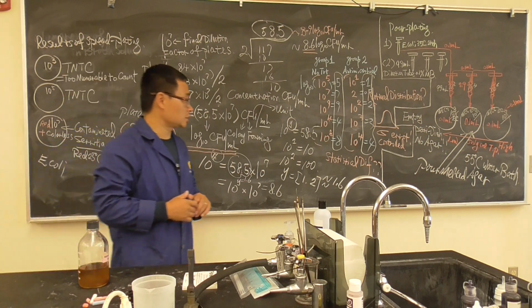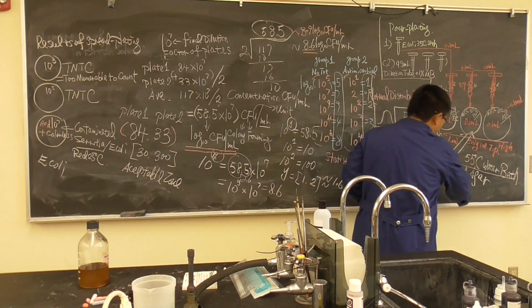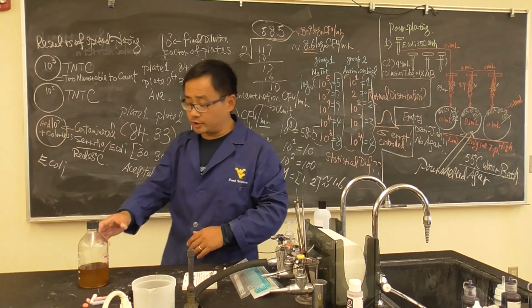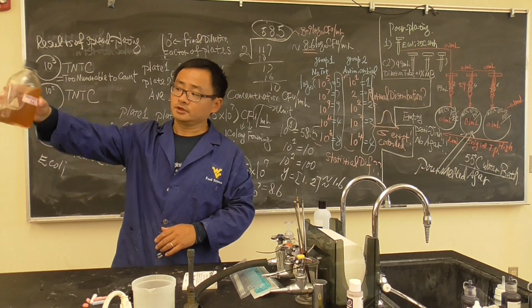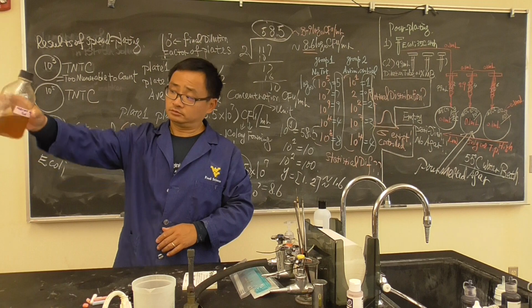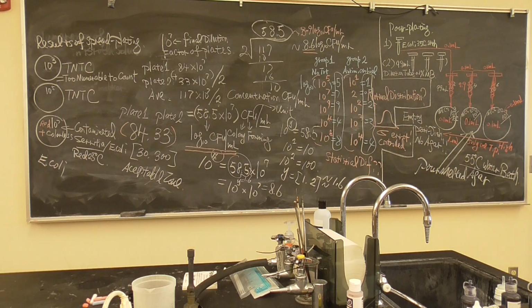Okay, so that is going to be the procedure. We'll do it individually. You need to wear gloves. If you're interested, the TA will let you pour a little bit. But also make sure this agar, you see it's already melted, has already started to solidify in some of them. And make sure there's no bubble. I'll be around when you do the first couple of samples, just as an example.